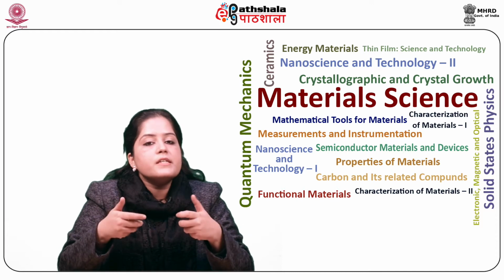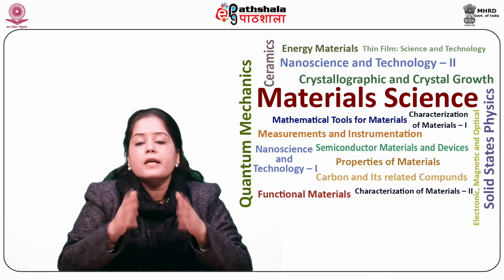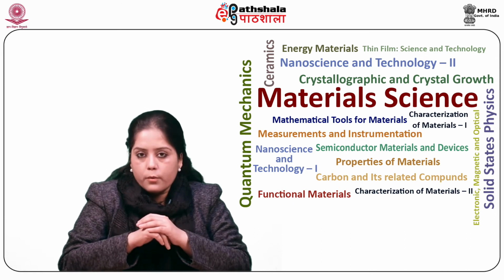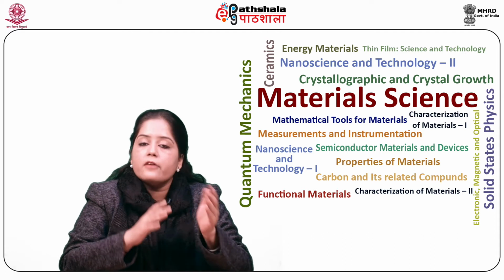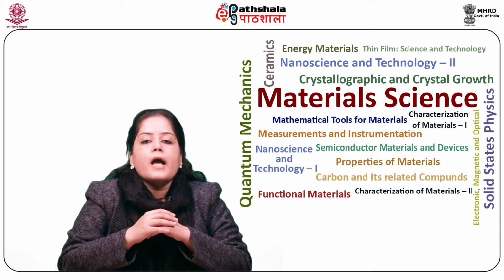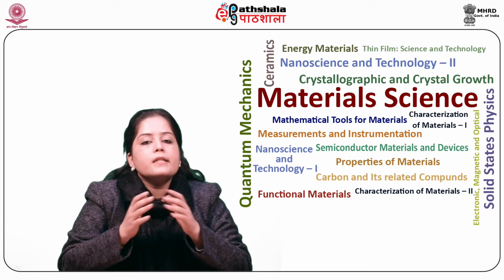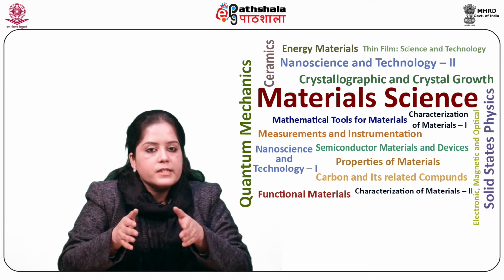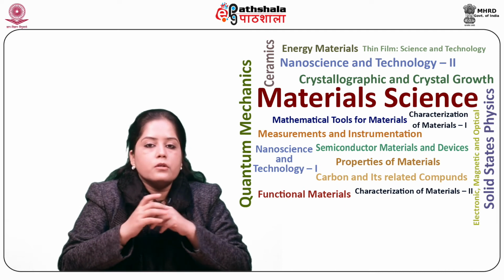So, the rapid development of scanning probe microscopy, and especially atomic force microscopy and piezo response force microscopy, AFM and PFM, has resulted in a fabulous advancement in this area, as will be highlighted in this module after a short description of the method.